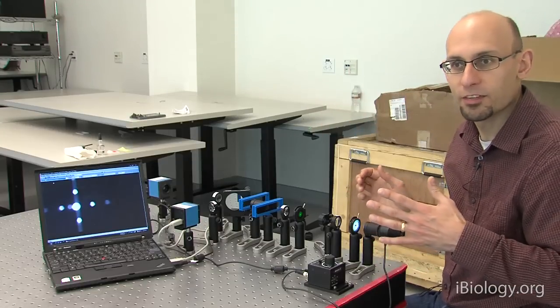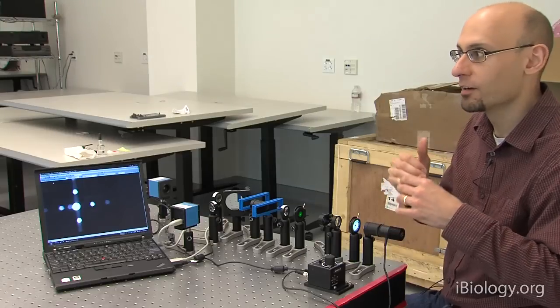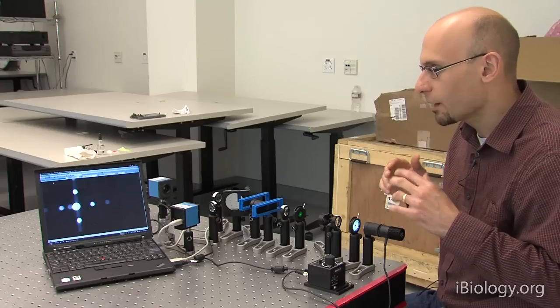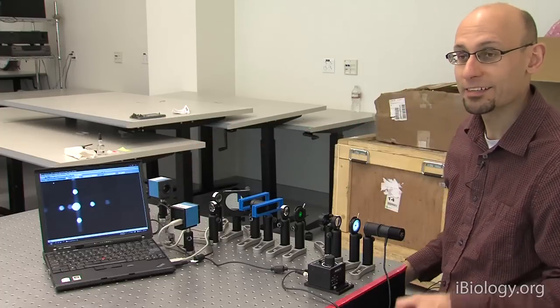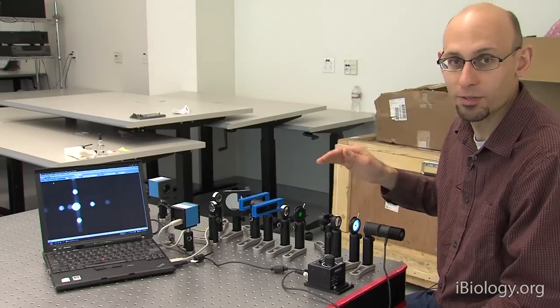OK, so now hopefully you've seen that position in the back focal plane tells you about both the spatial scale of your structures, so the size of your structures and how closely spaced they are together, and also their orientation. Now what I want to show you is that, in fact, this image here in the back focal plane contains all the information about your sample. And everything you can see in your sample is encoded in the back focal plane.